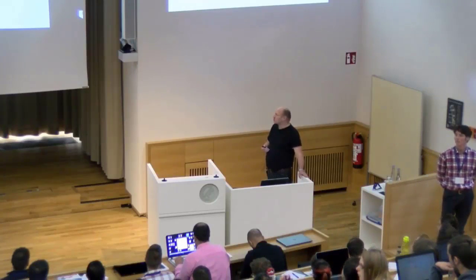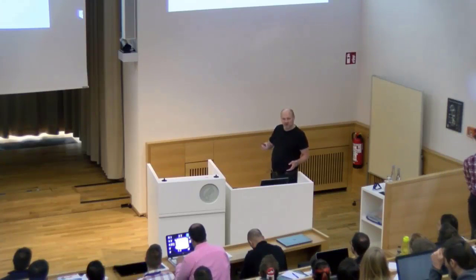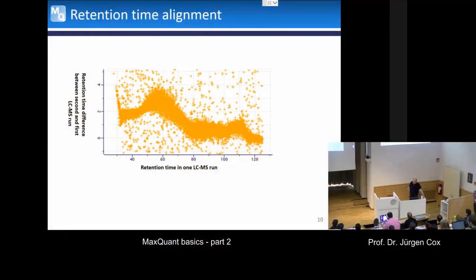Yeah, so you could put it to a large value in the beginning where you don't know what the proper value is, right? And then after looking at a plot like this, it's really easy to look at, because that's just in the evidence table basically. You could then come to the conclusion, okay, a time window of 5 would have been already enough, right? And so if you wanted to, you could then repeat it with a time window of 5 to kill a few false positives. So that's, yeah. Well, no, it's not.